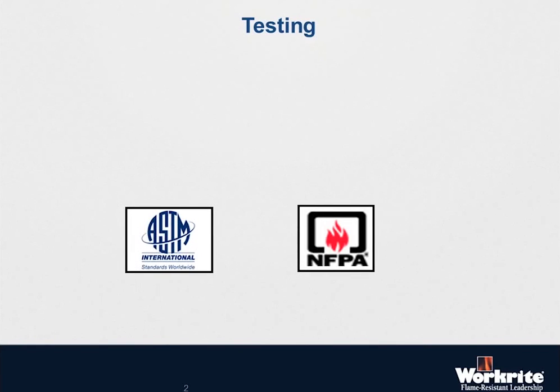The typical testing methods are either developed by ASTM or NFPA, depending on which standard you're talking about. So we're going to touch on a couple of those. We're going to talk about basic flammability testing, which is one of the key first things that all fabrics have to go through to make sure that they meet the requirements to be considered flame resistant. We'll also talk about the testing used to develop the arc ratings for those garments designed to be used for electric arc flash protection.